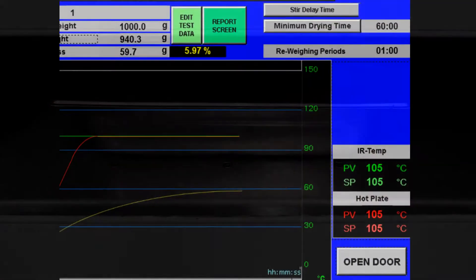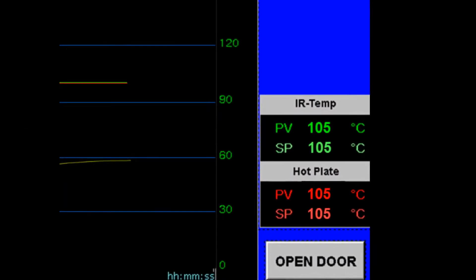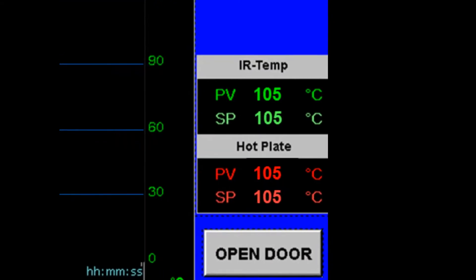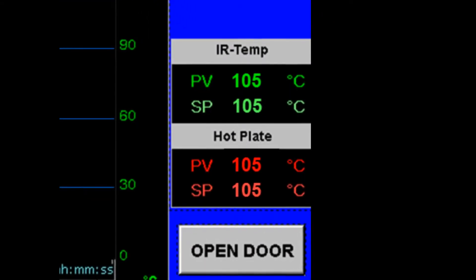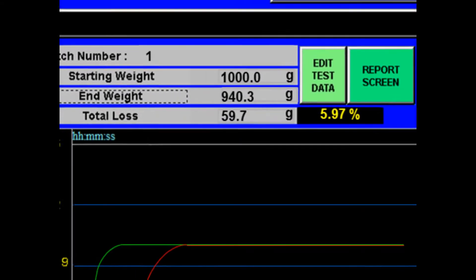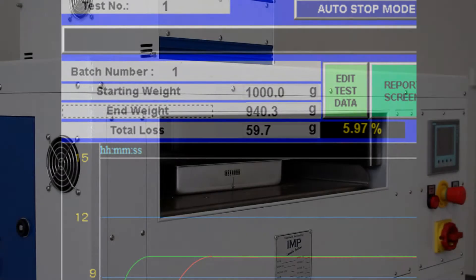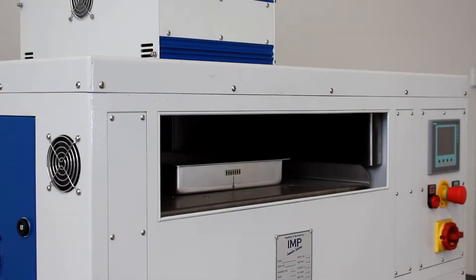During the entire process, the user is able to monitor the temperature of the infrared lamps and the hot plate as well as the current mass of the sample. This is achieved through the addition of a load cell in the RD20.